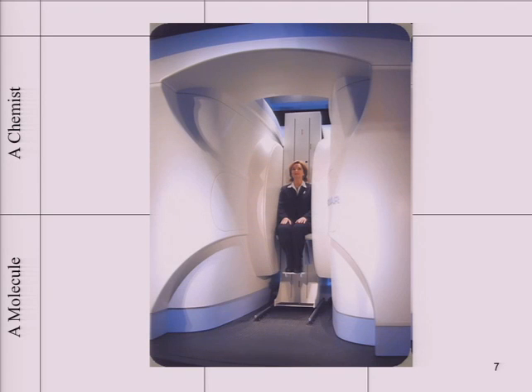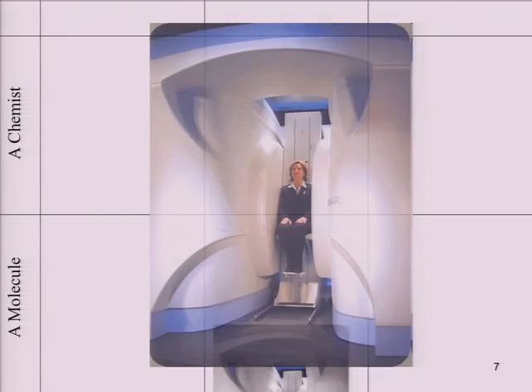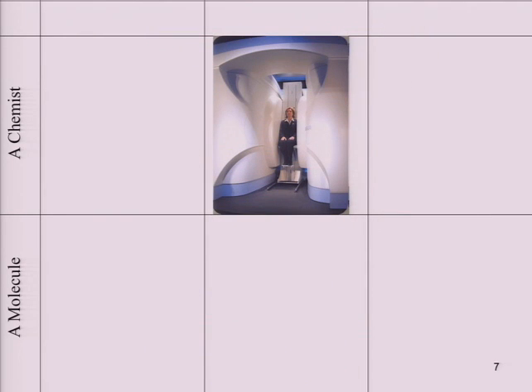This is an open-air, sit-down MRI machine from a hospital in New Jersey. And the reason you'd want an instrument like this to do single chemist spectroscopy is that whether you want to admit it or not, this is your natural conformation. In fact, you're all in this conformation right now. I get laughter from the single molecule crowd on that.